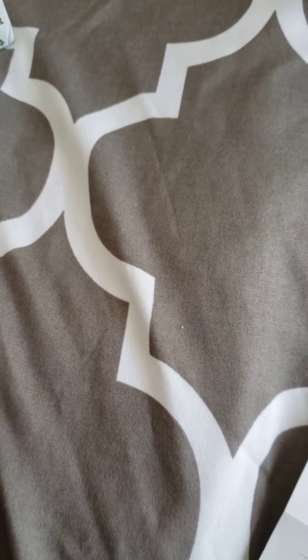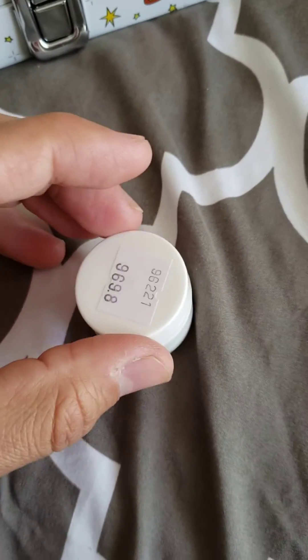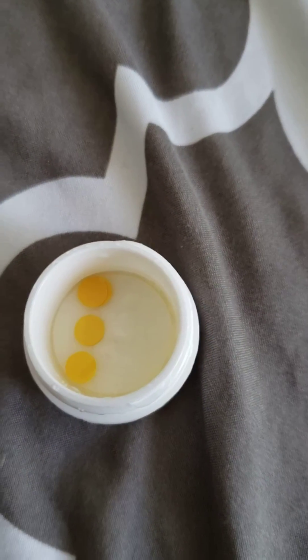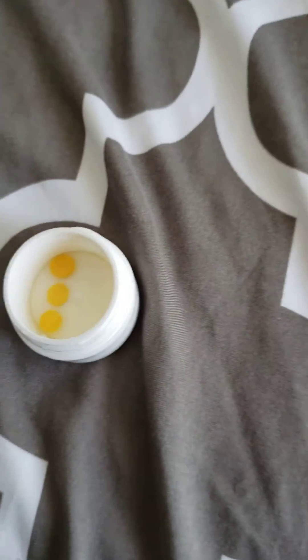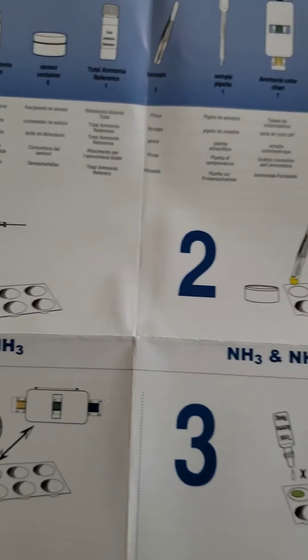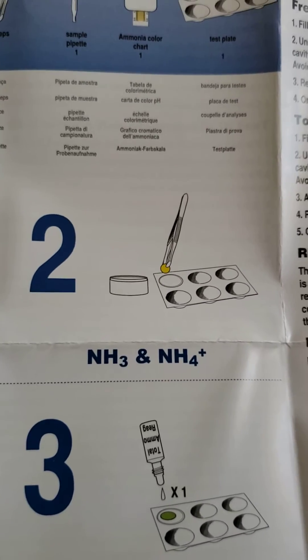To get those little cylinders in there, you grab them with these little forceps, pick it up, and then drop it in. I'm testing for free ammonia because I don't really care about the total ammonia — I care about the bad ammonia. So it's basically fill up the cavity and grab a little disc with the forceps.